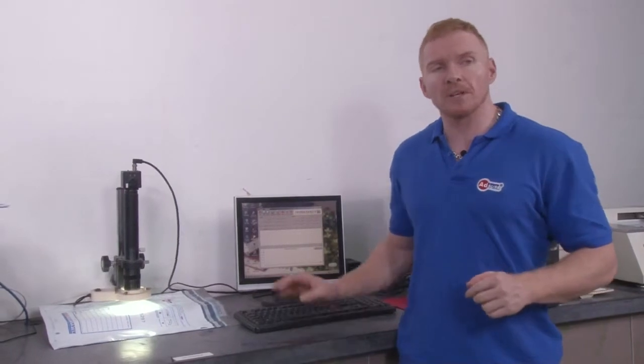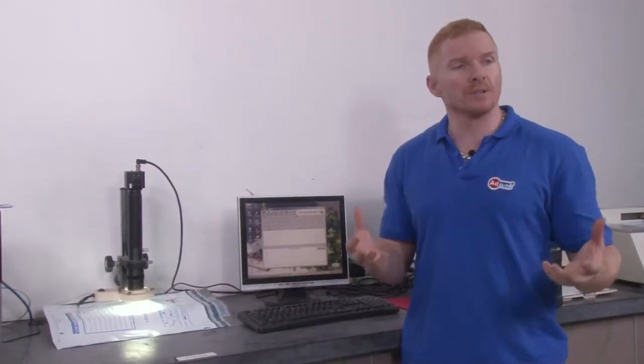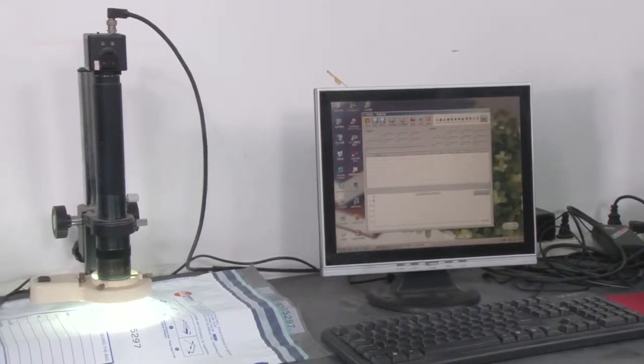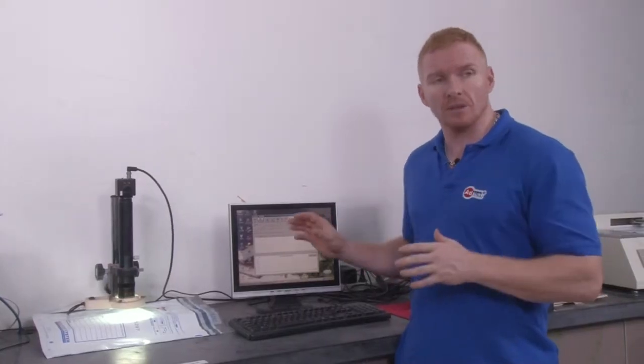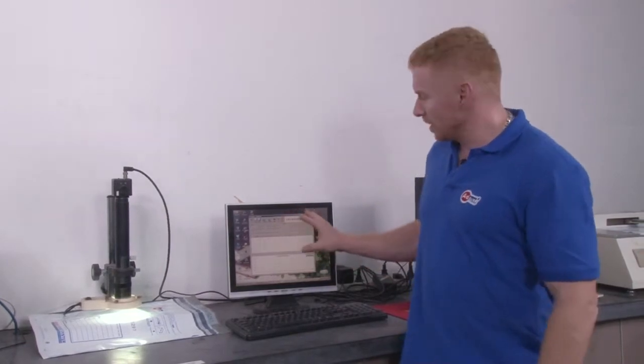This is the electrical microscope for magnifying the printing of our bags. It's very important to magnify the image captured on the computer. We can analyze during the printing process with different colors and paint, how they affect the outcome of the printing.